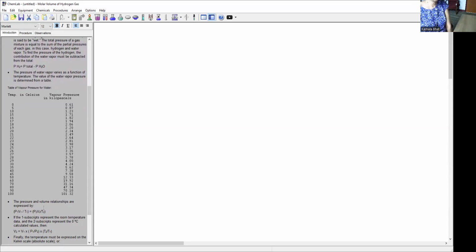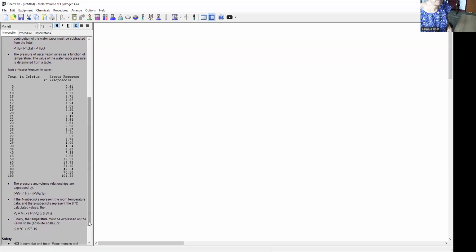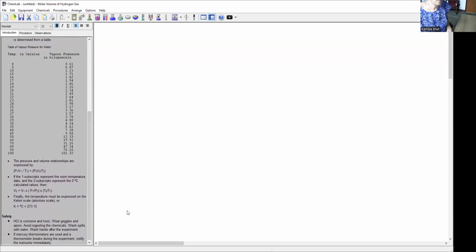Once you get the temperature corrected, then we know P2, T2, P1, V1, and T1, and therefore, for the given number of moles of magnesium metal that was used, we can get the volume. Once we get the volume, convert that by using Avogadro's law: V1 over N1 is equal to V2 over N2, where N2 will be equal to 1 mole. And so we have to do the experiment.